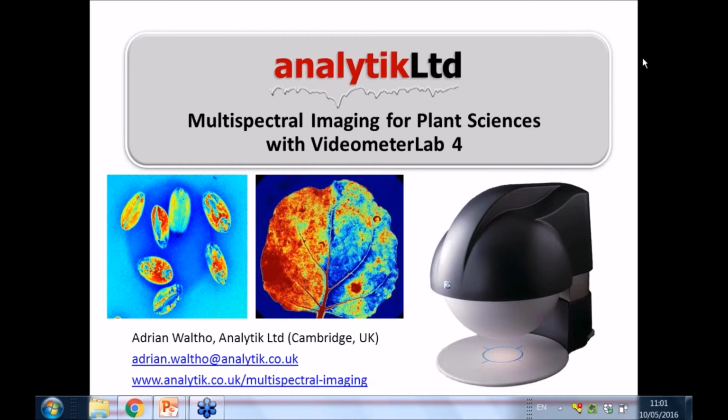But I will start off, first of all, by talking a bit about the background to spectral imaging, and where it comes from. I'll tell you a little bit about the kind of hyperspectral imaging hardware that Analytik can supply from Headwall Photonics. I'll show you a few examples of precision agricultural applications for hyperspectral imaging.